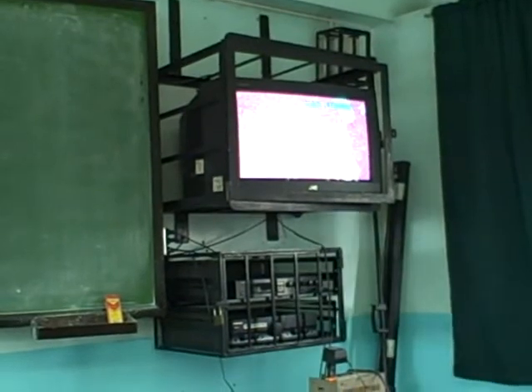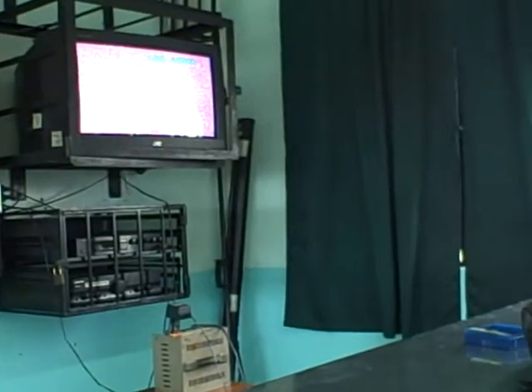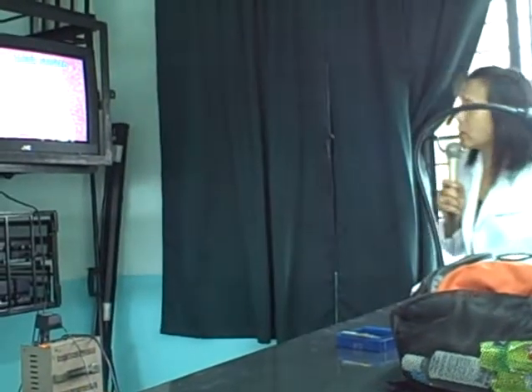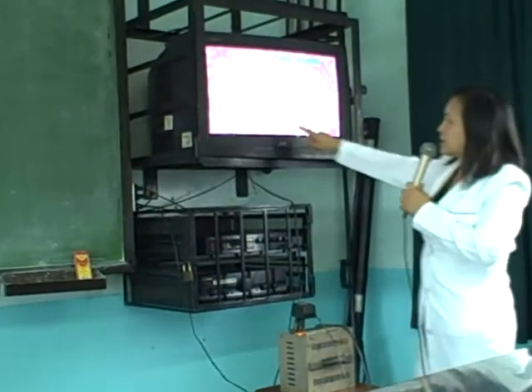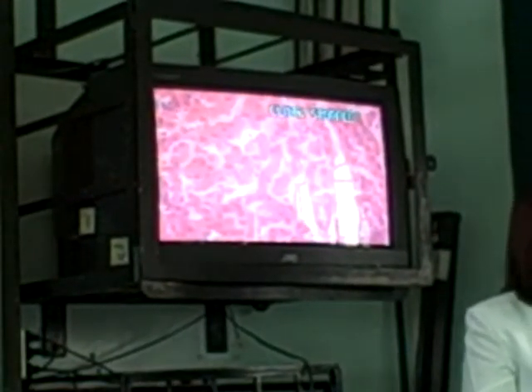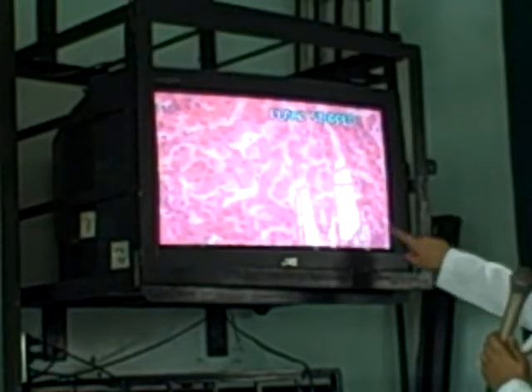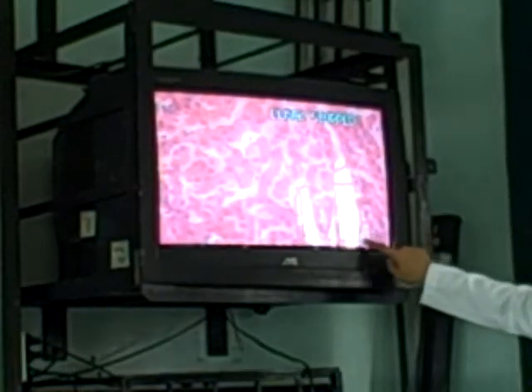Characteristic cells that are arranged in cords or in rows, so you also call them hepatic plates, and they are separated in between by your sinusoids. So you can see the hepatic plates, and in between the spaces are your hepatic sinusoids. Remember that hepatic sinusoids are lined by endothelial cells, and they are associated with macrophages. The macrophages are commonly irregular-shaped cells which you can also find in your sinusoids.